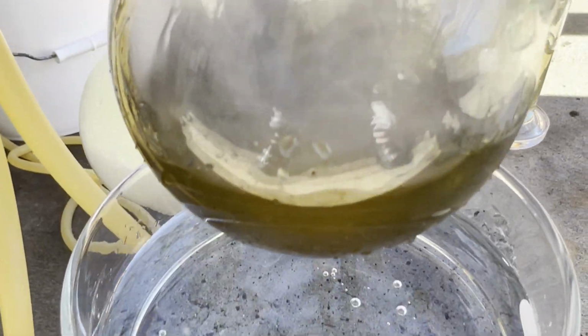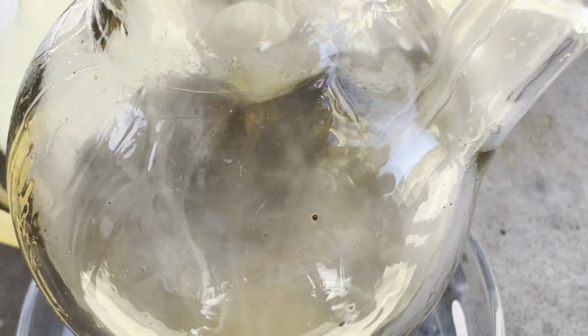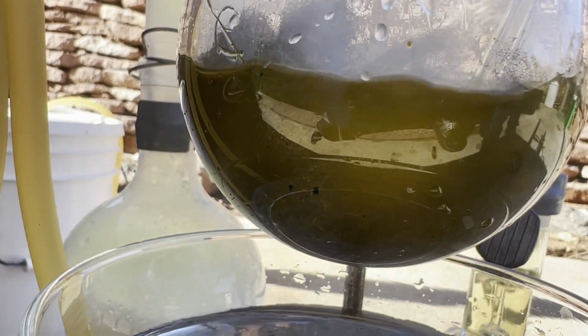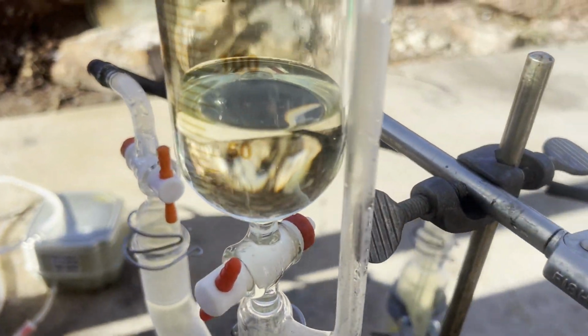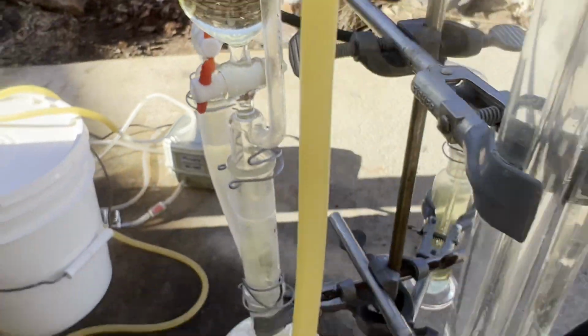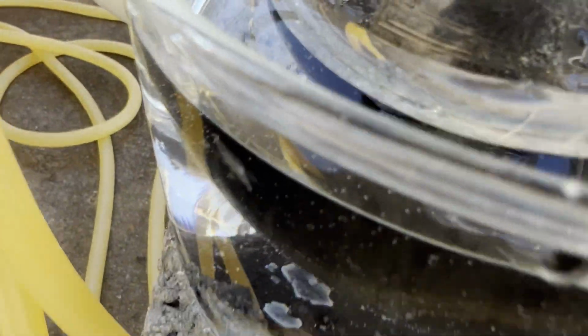Once the chlorine starts to pass through the reaction mixture, you will see some white smoke. That is hydrogen chloride that's produced when chlorine reacts with benzene. It looks like white smoke because there's water vapor in the air, and it's forming hydrochloric acid fumes. One part of the footage I lost was holding pH paper over the condenser, and it immediately turns red when it comes into contact with the vapors.